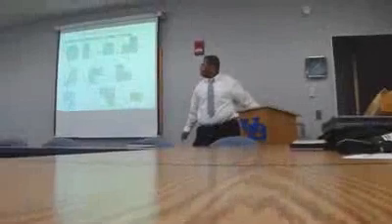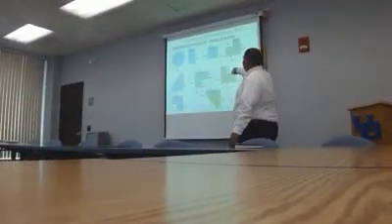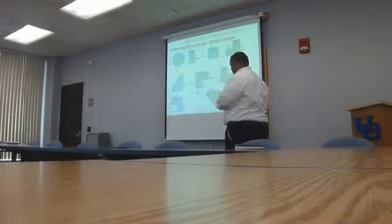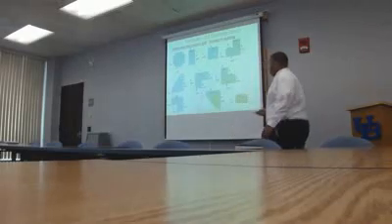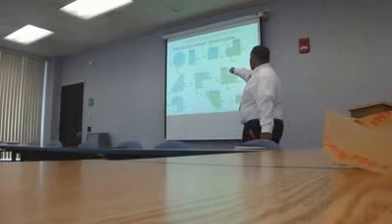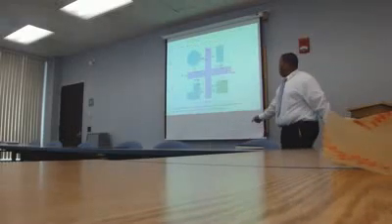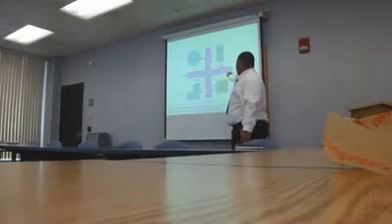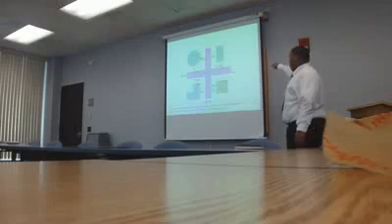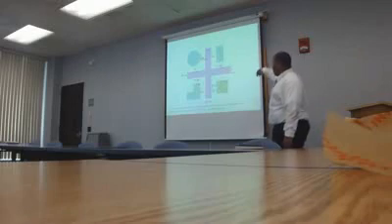This is how the grids look. If you start from the left and go to the right, these shapes represent numbers. On the graphene substrate it's really hard to find anything, so we go from the left, which is 0, and then it goes on: 0, 1, 2, 3, and so forth. In this example, the left bar coincides with the row number, and the right side with the column number.